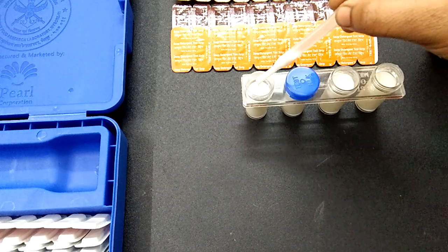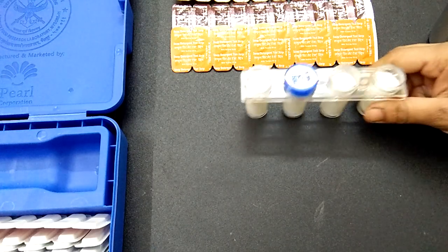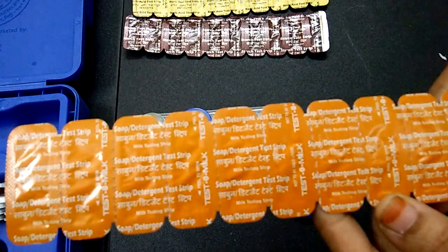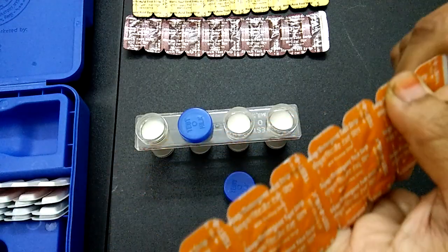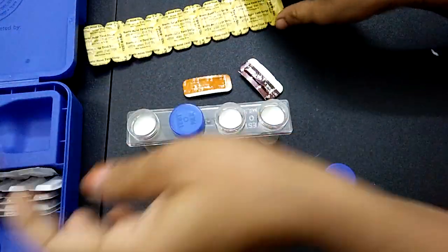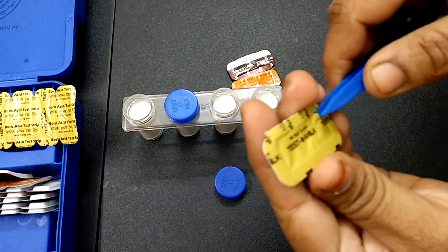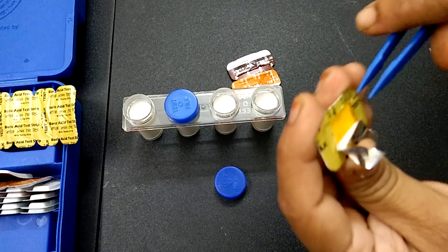I am filling tubes for boric acid, starch, and detergent. I have filled these remaining tubes. This is the strip for soap and detergent — I'll cut it. Similarly, I am going to cut the starch and boric acid strips. I will use forceps to put the respective strips into the jars.